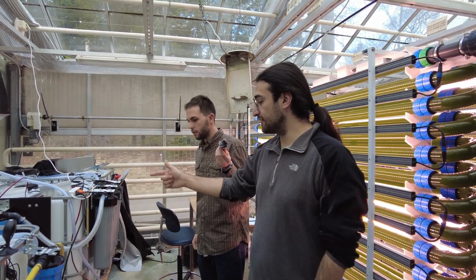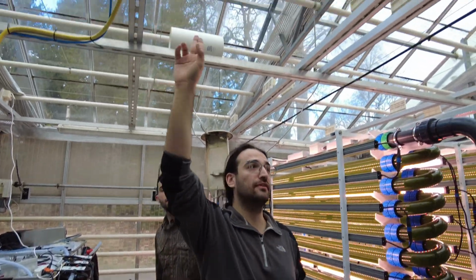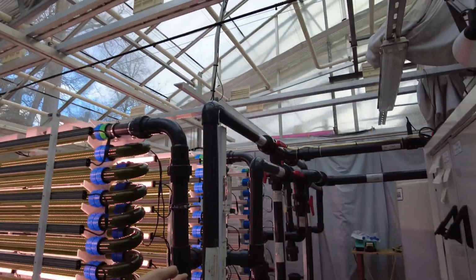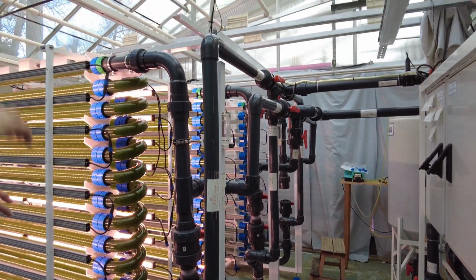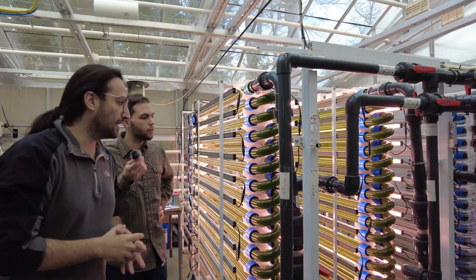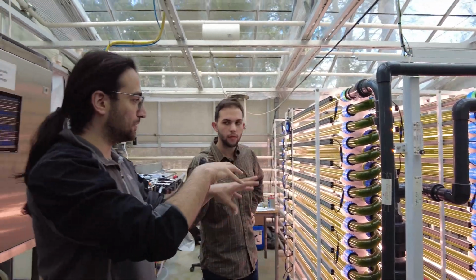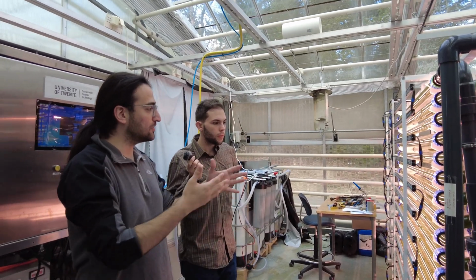And then this filtered wastewater, you will see a pipeline, the treated wastewater is going to the photobioreactor. And our algae from the other compartment joins too. So this is called the inoculation process. And as our algae is joining the PBR, our PBR is turning green. That means our algae is growing.